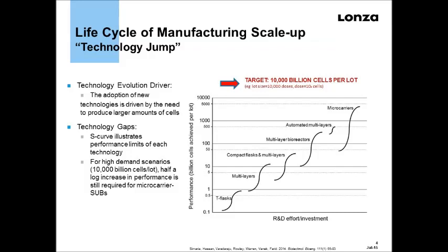Today, I'm going to focus on probably the first scale product that we can get and manufacture a commercially viable number of cells. So remember, as opposed to all the other technologies you're talking about, these have to be adherent because the cells cannot be in suspension. So you have to find a way to attach these cells to a bead, put them in a suspension culture, add more and more beads as you expand up because you need these things to go through passages and growing up. And in the end, you have to get the cells off the bead, alive and viable.